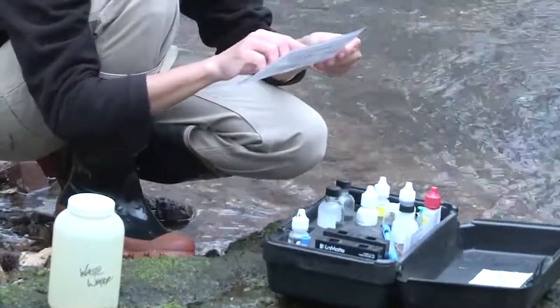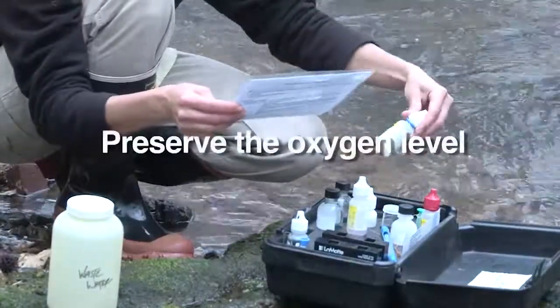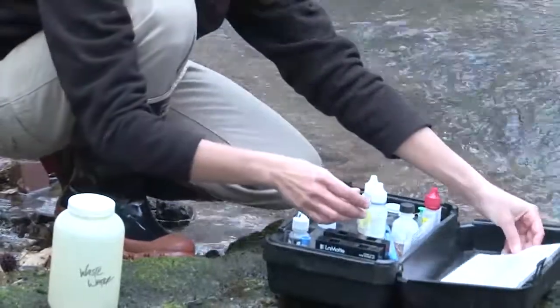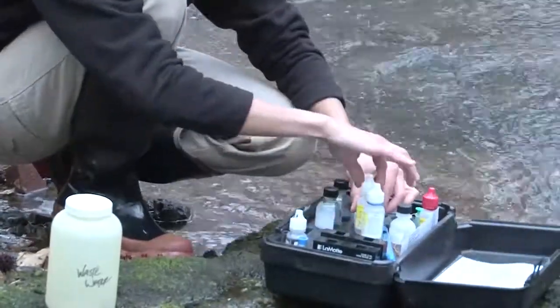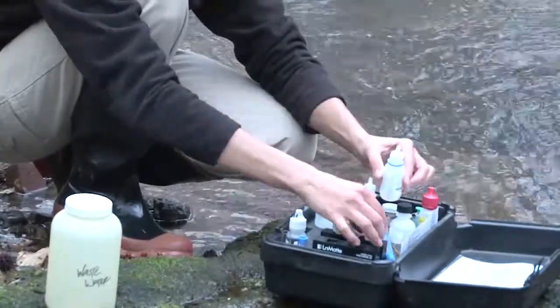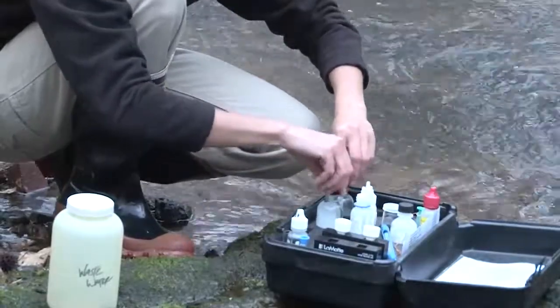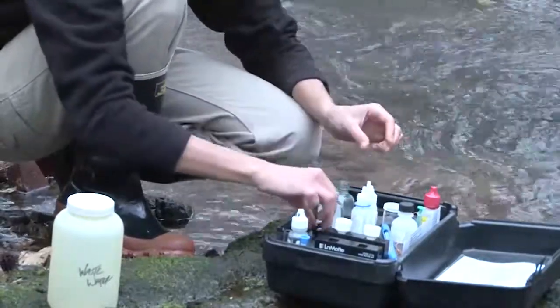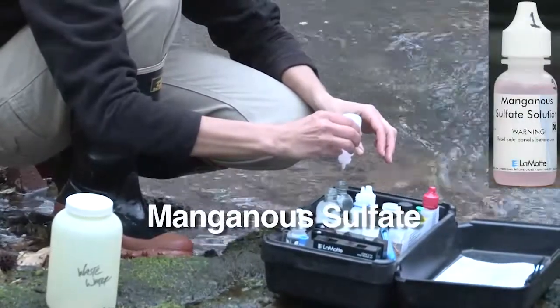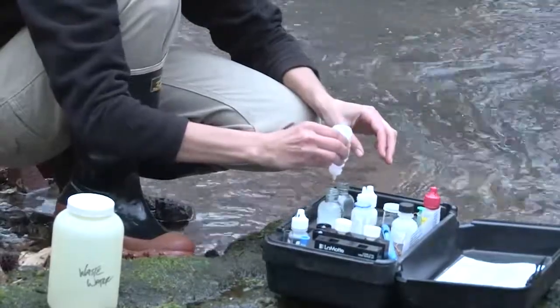Tara reviews the directions one more time. The next step is to preserve the oxygen level, or fix the sample. To limit the exposure to the oxygen in outside air, she waits to open the water samples until after she's opened the first two reagents. Tara places the caps in the kit to avoid contamination by dirt. She adds eight drops of manganous sulfate, holding the bottles vertically so each drop comes out the same size.